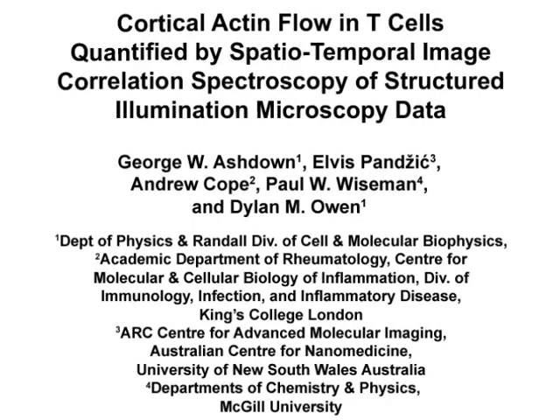The overall goal of this experiment is to quantify the dynamics of cortical actin by image correlation spectroscopy, following acquisition by total internal reflection structured illumination imaging, or TIRF-SIM.